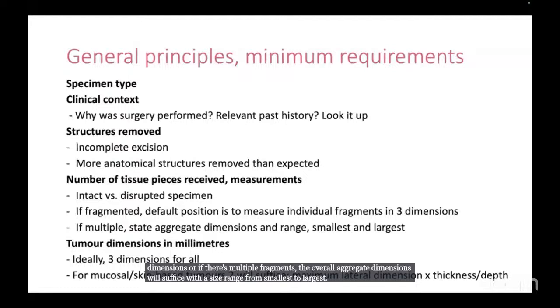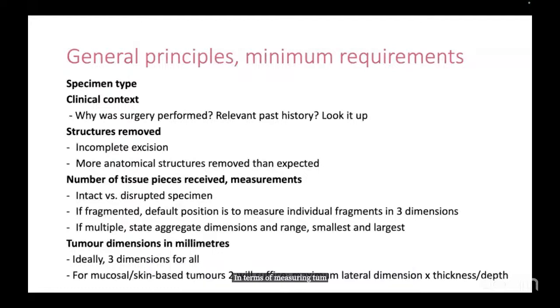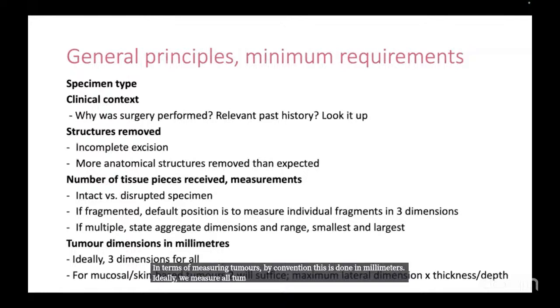In terms of measuring tumours, by convention, this is done in millimetres. Ideally, we measure all tumours in 3 dimensions, and if it's a mucosally or skin-based tumour, this is the 2 perpendicular horizontal or lateral dimensions, and then the estimated depth of invasion once the tissue has been sliced, which is measured from the mucosal surface to the deepest point of invasion.